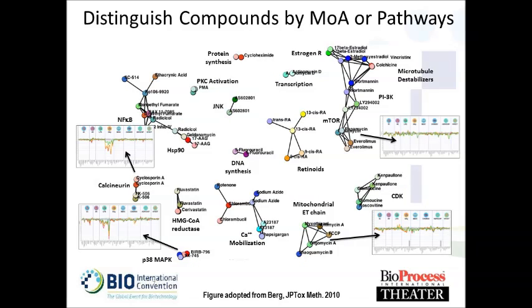Here, what we've done is taken one of the profiles that I showed you for prednisolone, and we're representing that by a single point here. So here, for example, in the bottom left are 2 different p38 MAP kinase inhibitors, either the BIRB796, shading here indicates 2 different concentrations of that drug, or the VX745. We then do a Pearson correlation and look at how similar these profiles are to each other, connect them with a line if they share a Pearson of above 0.7, and the length of the line indicates the overall similarity of those 2 profiles. What this means is that we can identify by their phenotypic profiles that they produce common mechanisms of action of these drugs.